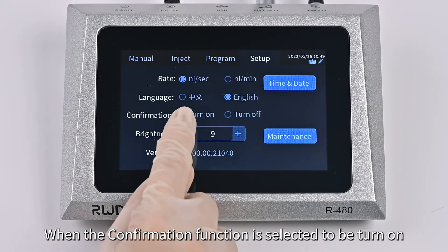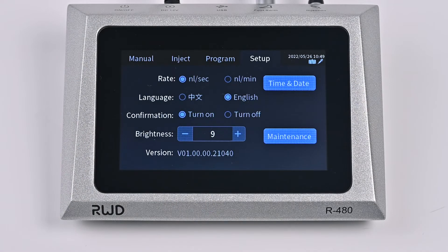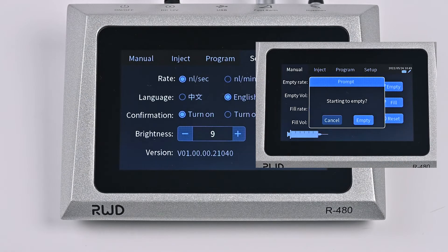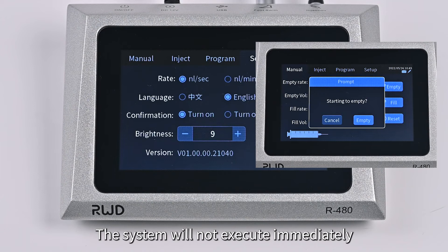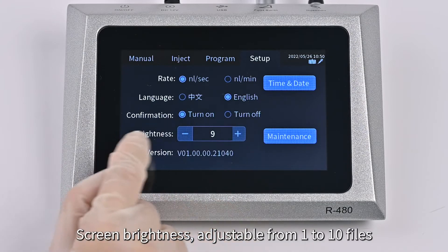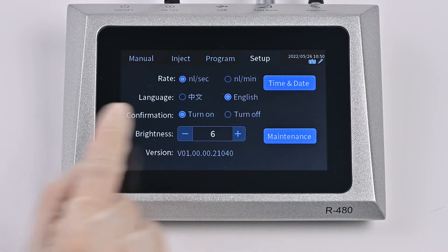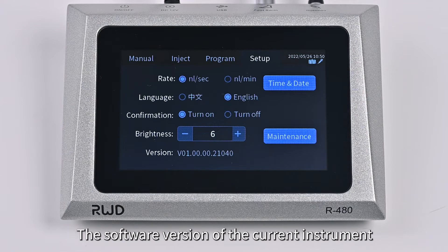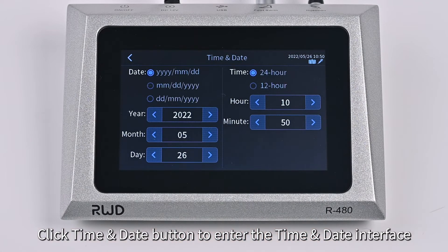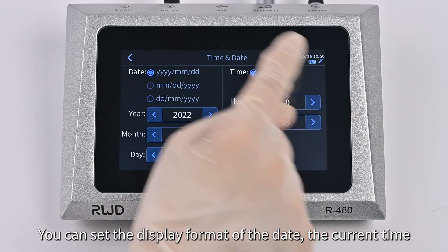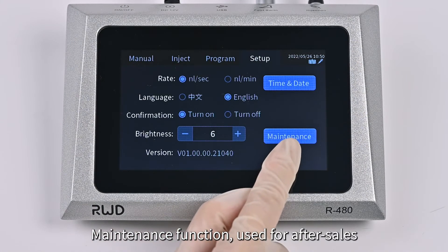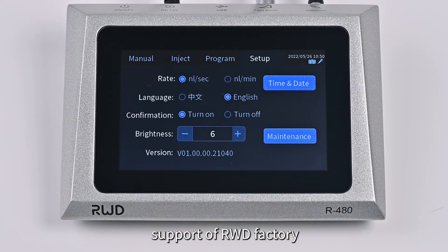You can set the rate unit and system language according to your needs. When the confirmation function is turned on, clicking keys involving fill, empty, and reset on the manual interface will not execute immediately — you need to click OK first. Screen brightness is adjustable from 1 to 10 levels. The software version of the current instrument is displayed at the bottom of the interface. Click the Time and Date button to enter the time-date interface, where you can set the display format of the date and the current time. The Maintenance function is used for after-sales support by RWD Factory.